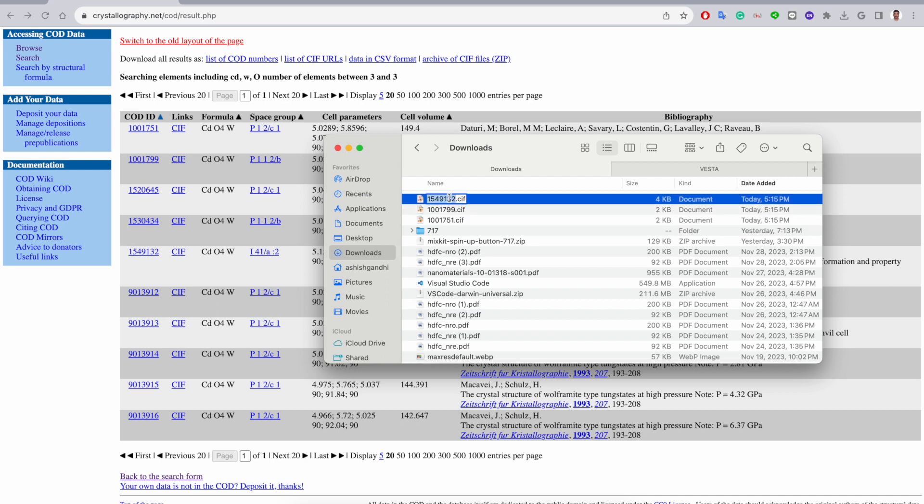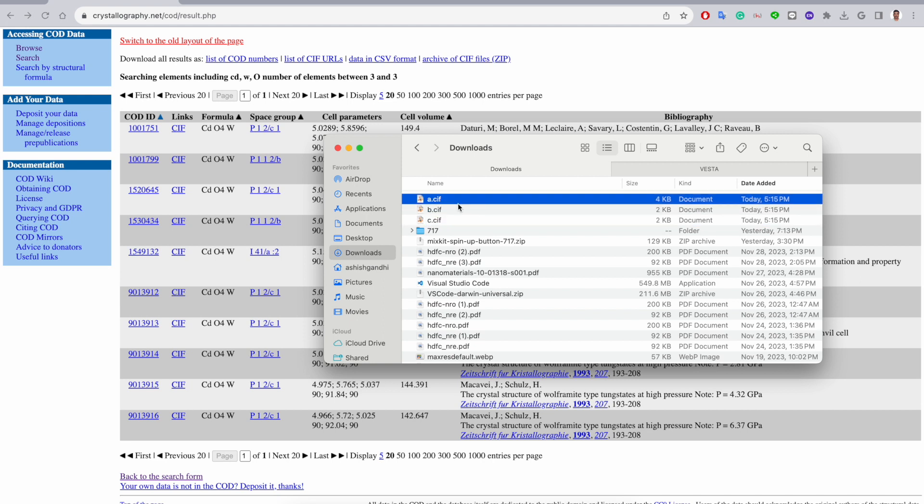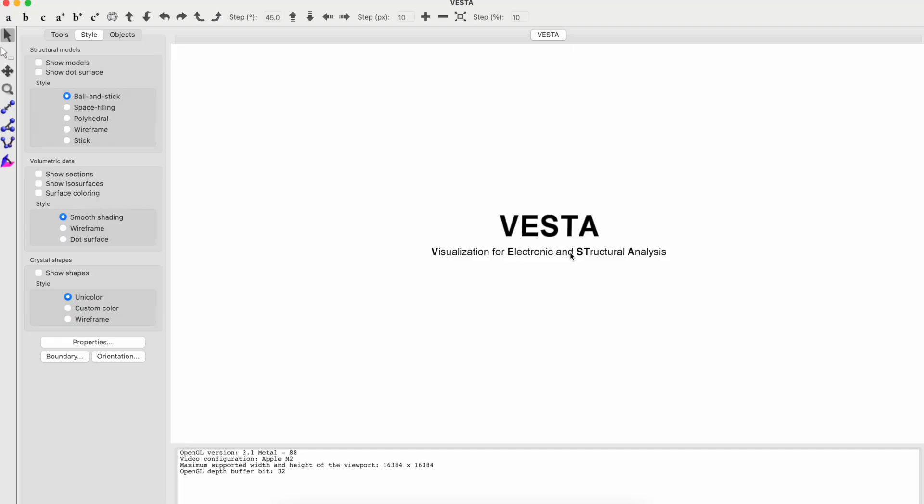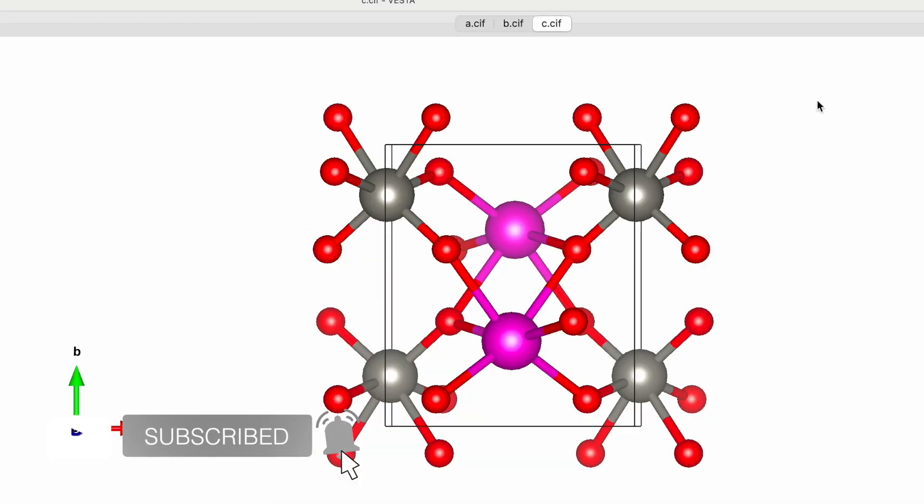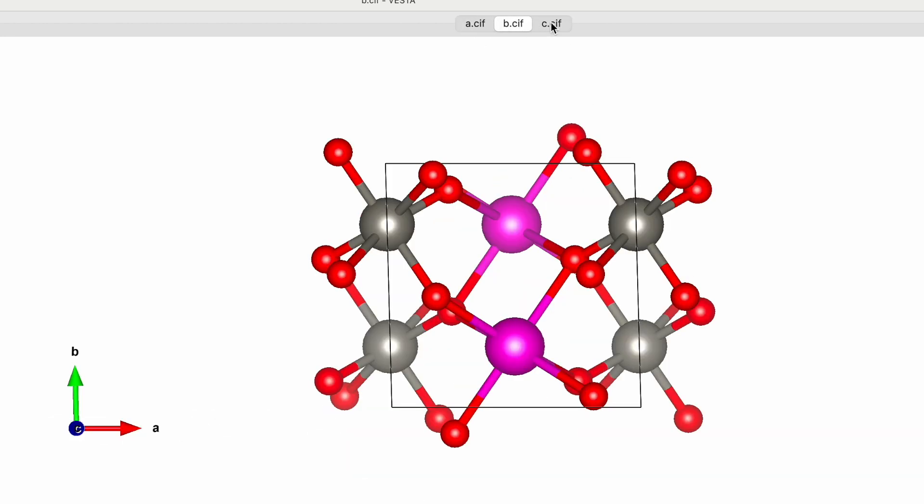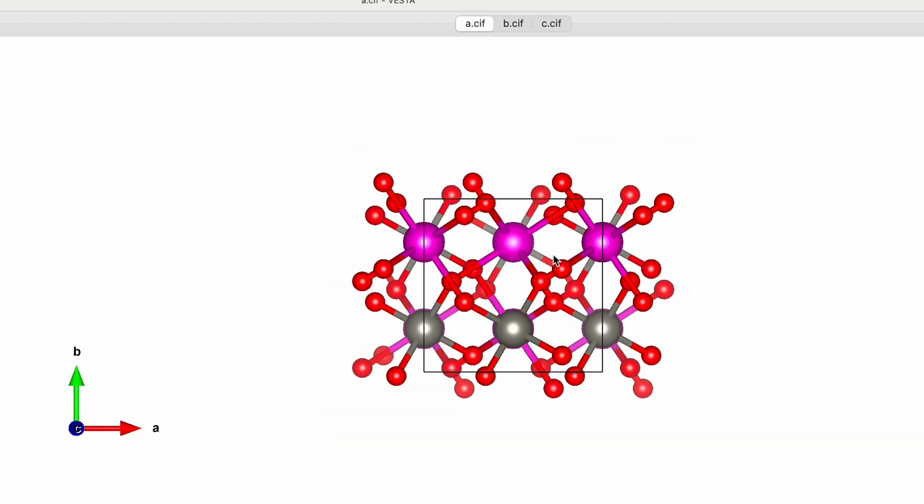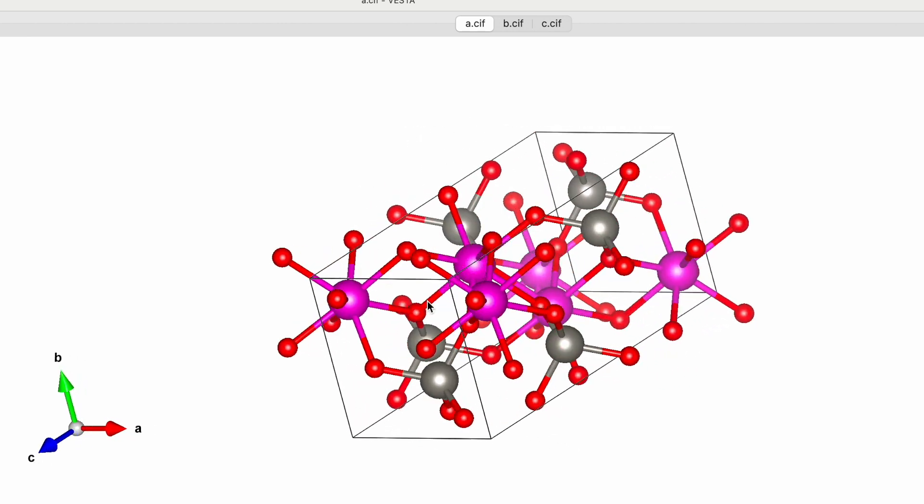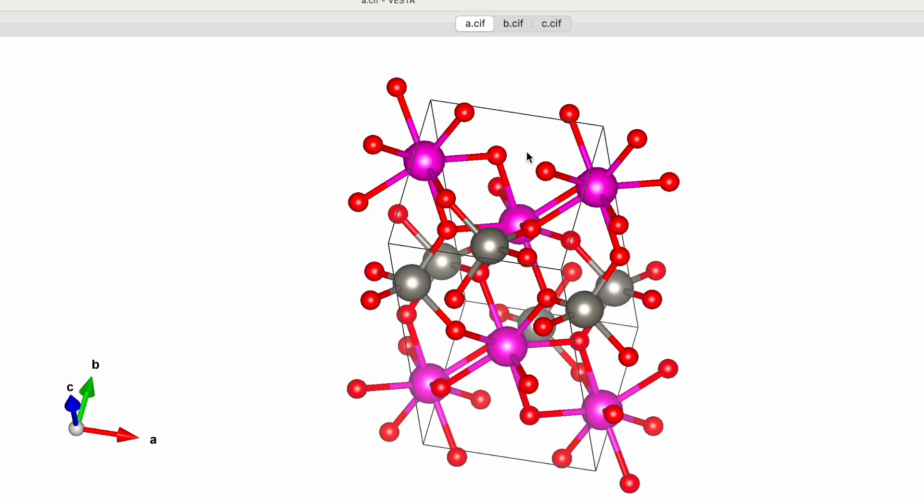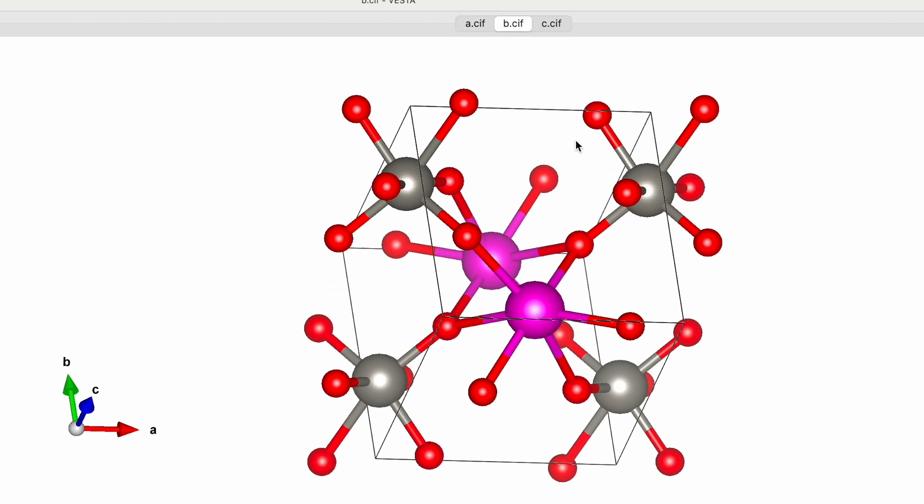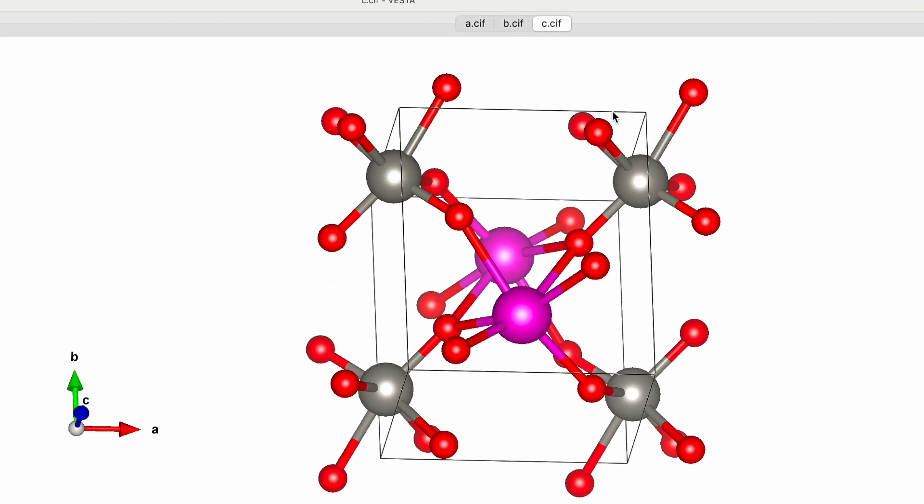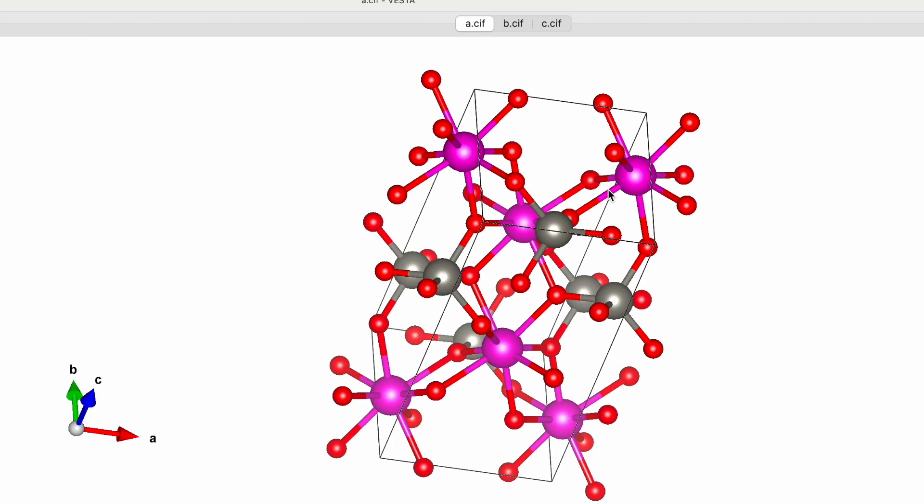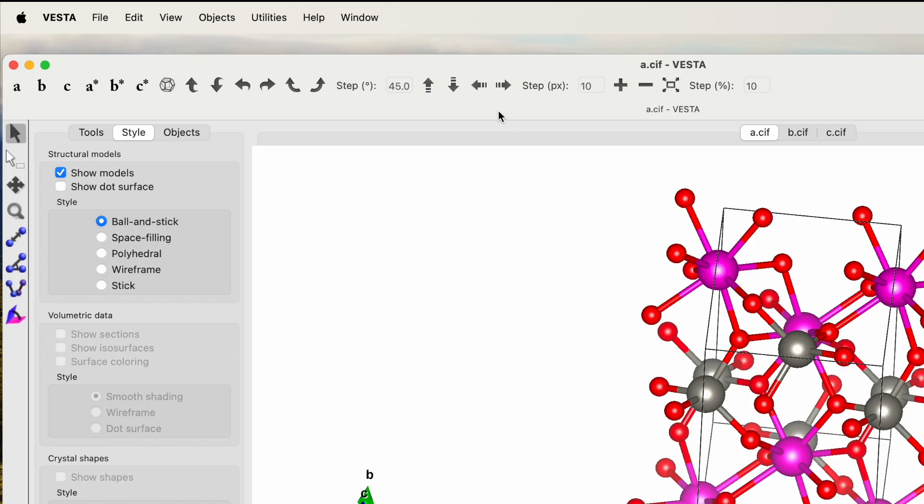Now go to the VESTA software. Open the software, go to the download folder, and drag the CIF file on the top side. You can see if you click on these files you will see different unit cells. Use your mouse and you can drag and move this one so you can see the 3D format of this unit cell. Over here, you will see the unit cell for B and C looks pretty similar, but for A is totally different.